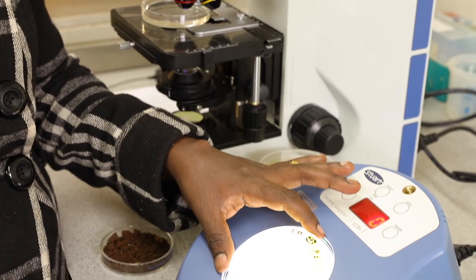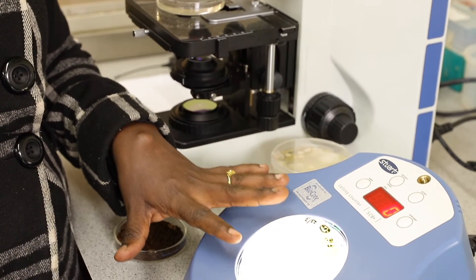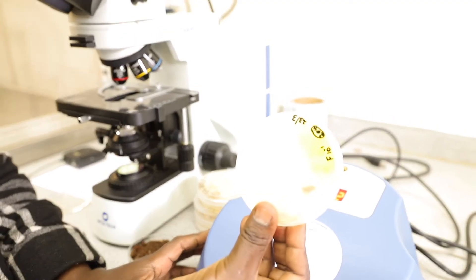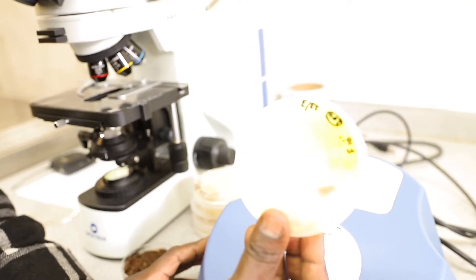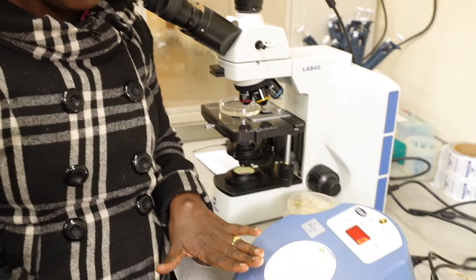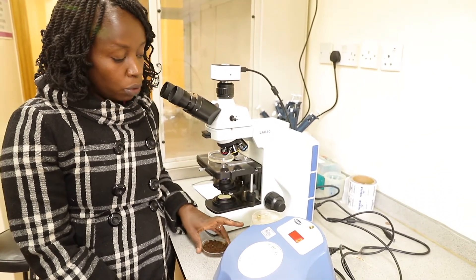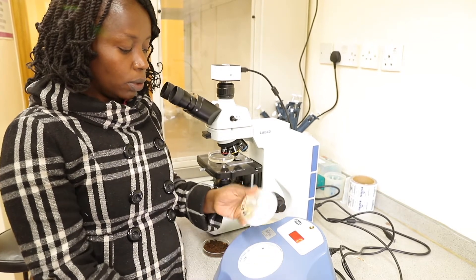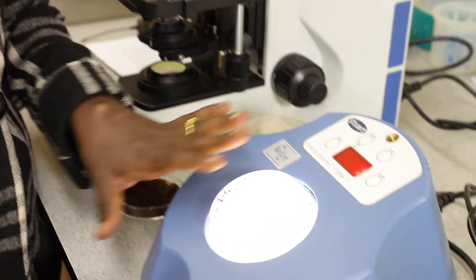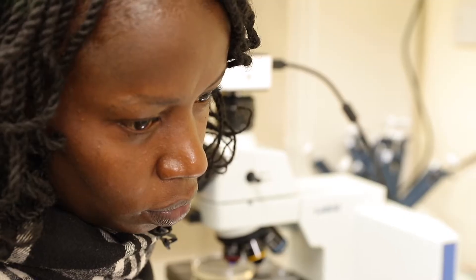If we want to do more studies, we are able to pick a different culture from here and do a pure culture based on the observable features. Here we have pink color, which is showing a species of fungi; we have brown, and we have yellow. We are also able to do a bacteria culture in the same way, and we are able to get our colonies. We use these to count the colonies, which shows the microbial community that is in the soil.